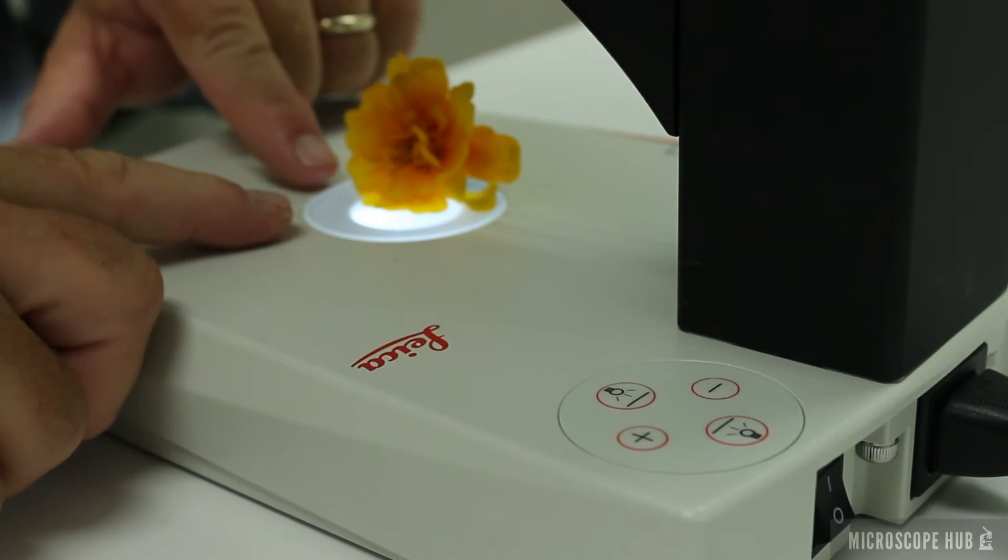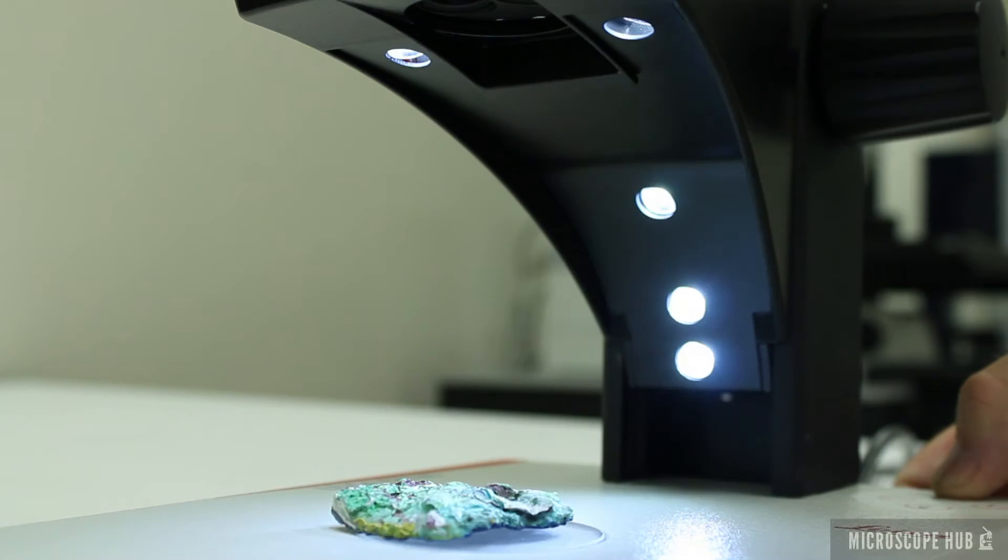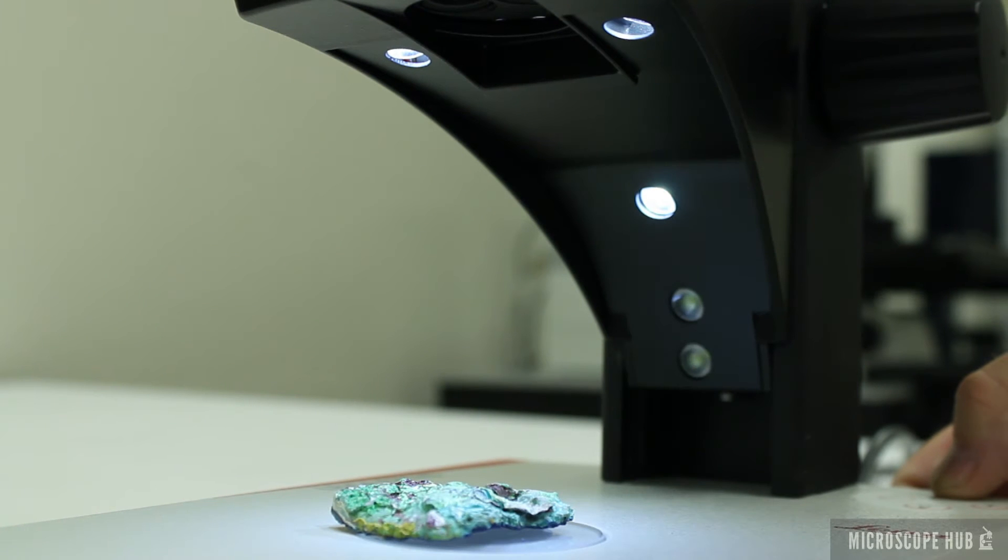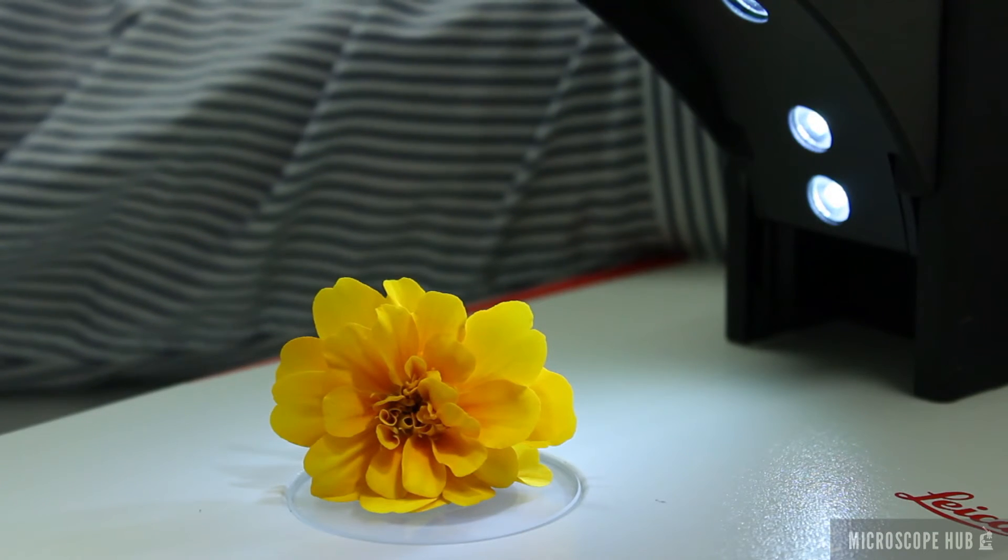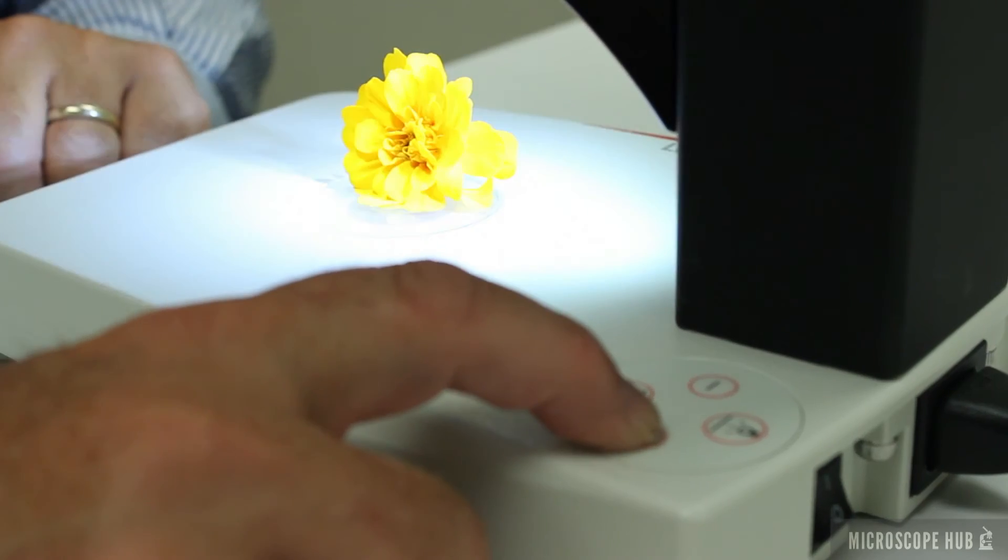The design features both a transmitted LED light stage and incident LED lights from multiple angles. It offers adjustment control over light direction and light intensity.